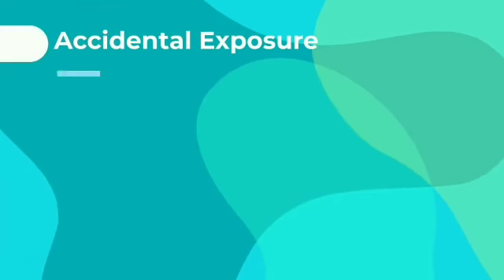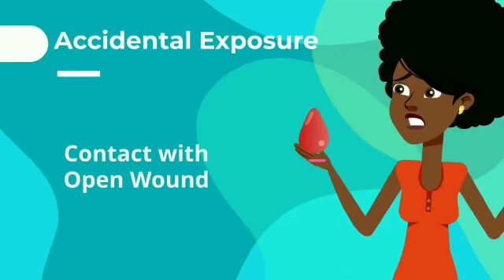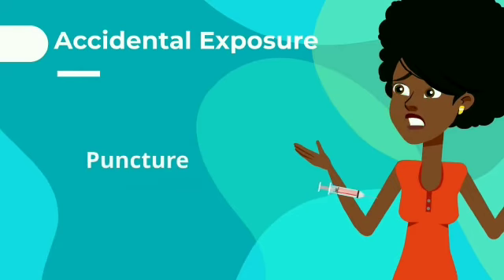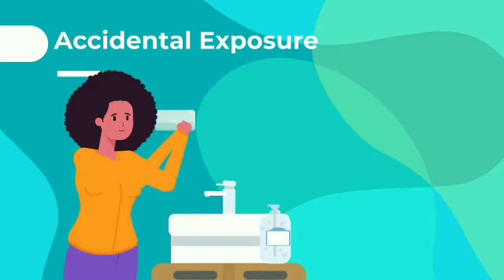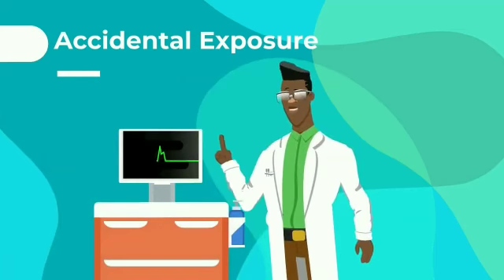Accidental exposure can include direct fluid to skin contact, direct fluid contact with non-intact skin like an open cut, contamination of mucous membrane, or a puncture cut by an object contaminated with body fluids. If you have been exposed, you should immediately wash contaminated skin with soap and water. Treat mucous membranes with water and speak with your supervisor and HR about medical follow-up.